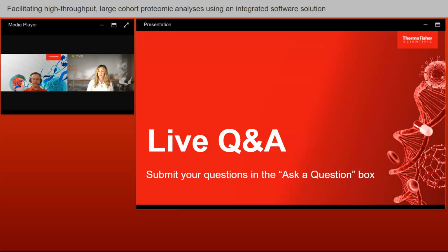We do have a statement that we've created for these questions, and we can send that to you. That explains more detail about all the information that's sent back and forth. And we don't store your data at all. So once the Chimeras search is done, it will download the results back to Proteome Discoverer, and that's the only place where that data will be located. So we do our best. We just take the minimum information possible, and there's little to no sign of that search after the fact.